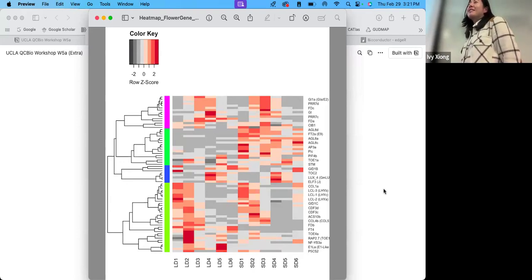Yeah, I wonder what that is. This is identical to yours. Uh-huh. What can I say? Somehow you clicked into a different universe. Yeah, it sounds like it. But there were so many. I remember, what was it called? SRA. This one selector. But it's not even that, it was the difference. Using the same recount table, right? The matrix, oh yeah, the same input. It's a very interesting scenario, no?